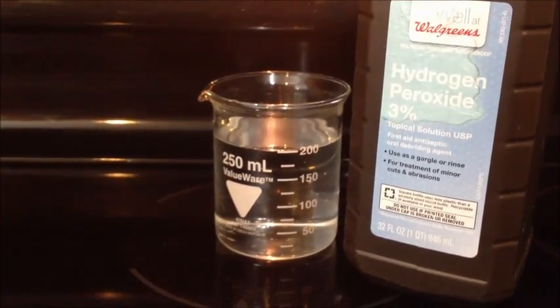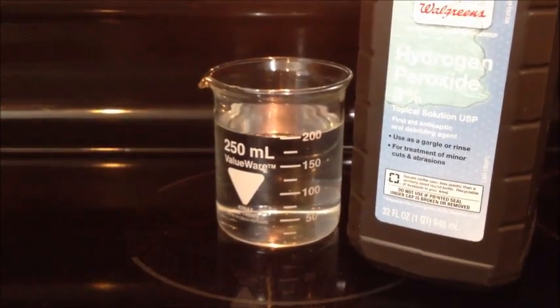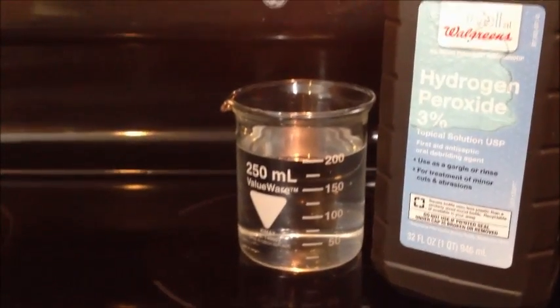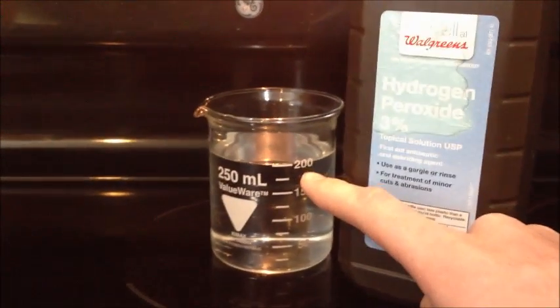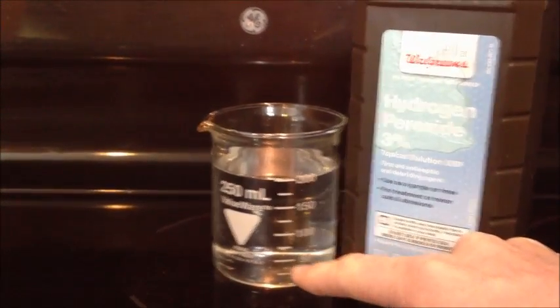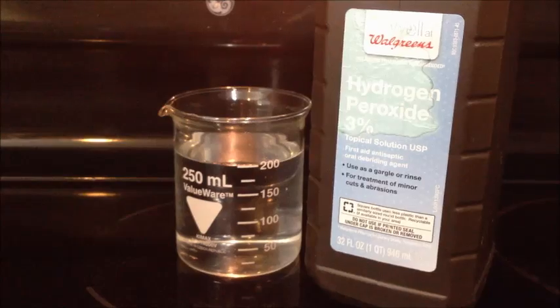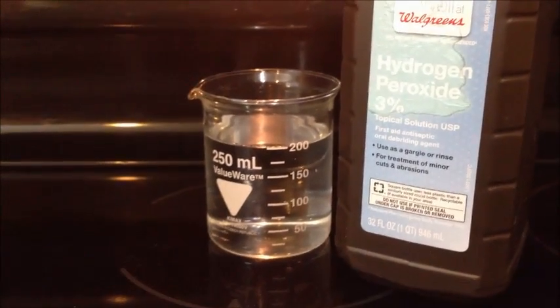You're going to start with a beaker — I just measured out about 200 milliliters. If it's 3% and you want to get to 30%, that's a 10 times increase, so I'm going to be evaporating the water out of the hydrogen peroxide. We're going to wait until the liquid gets down to about 20 milliliters, and theoretically it should be about 30%, but you don't need anything that specific for whatever you're trying to do really.